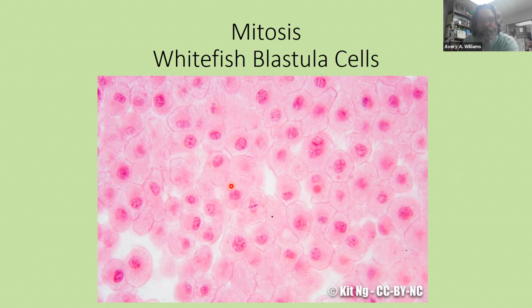And so most of these cells, if they just look like the normal animal cell with an intact cell membrane, intact nuclear membrane, the nucleus, nucleoplasm, it's not dividing. It's not undergoing mitosis. If it's not undergoing mitosis, that stage in the life history of the cell is called interphase. And so most of these cells that you see, with the exception of this one, let's ignore this one for right now, most of these cells are in interphase. And so that's kind of what you think of.